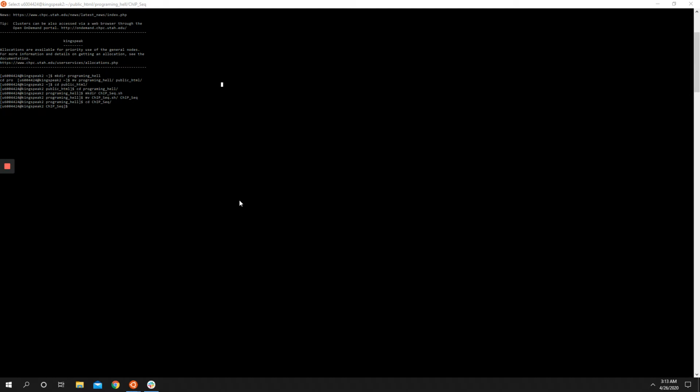One is shells. Shells are just an environment. An environment is where you have variables set and an interpreter. So when we talk about bash, bash is actually an interpreter, which means it reads in human language and converts it into computer language. You can have another shell; I typically use a Python shell. So if you go in and just type Python, you now enter into a Python shell where the interpreter is Python. So if I try doing echo dog, which would work fine in a bash shell, it doesn't work because Python doesn't speak bash.